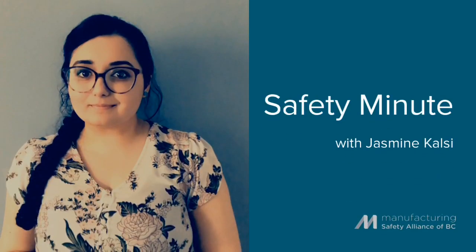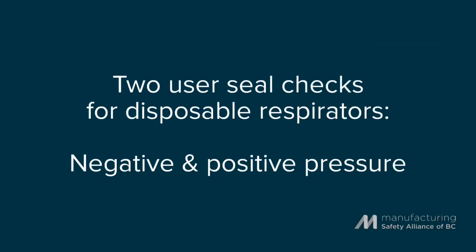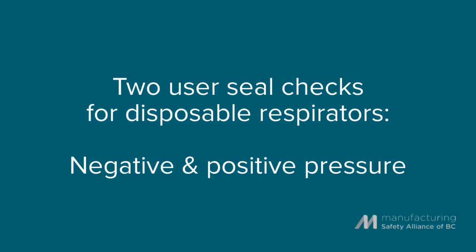Hi, my name is Jasmine Kelsey. I'm the occupational hygienist at the Manufacturing Safety Alliance of BC. Disposable respirators can have two user seal checks, negative and positive pressure. In this video, Safety Advisor Sherry Snow is going to demonstrate both.